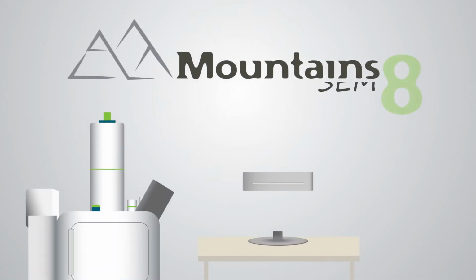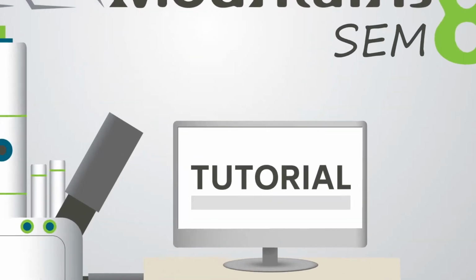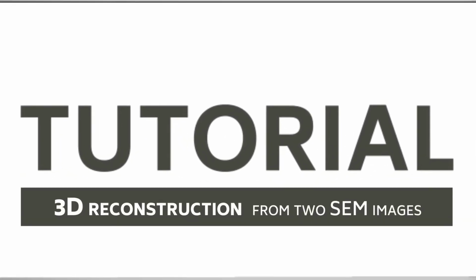Hello and welcome to this video tutorial on Mountains SEM, Digital Surf's industry standard software for scanning electron microscope data analysis. Today, I'm going to show you a quick and easy way to turn a stereo pair of SEM images into an accurately measurable 3D model.